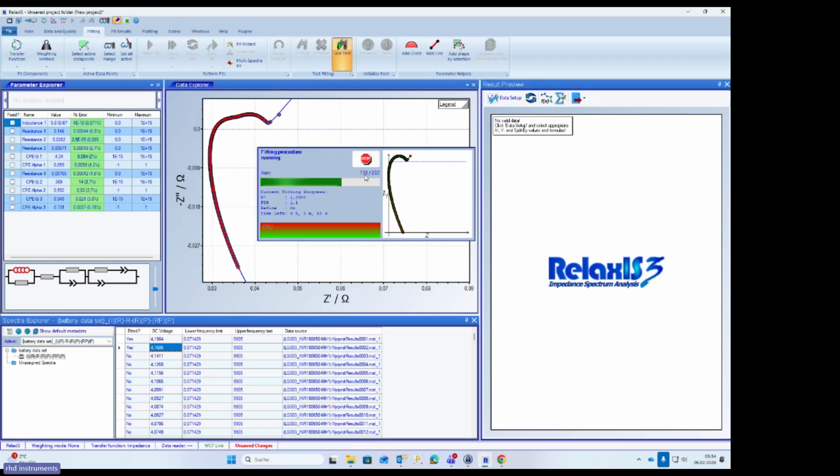And you always see here also a small preview to just check if the fit works more or less. For instance, if the fit would not work, we would see that this fit line, which is here slightly in green, would be off and would not go through the data points. But so far it seems as if this is working pretty well.